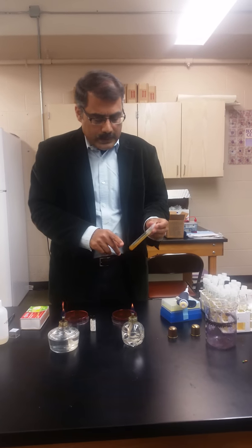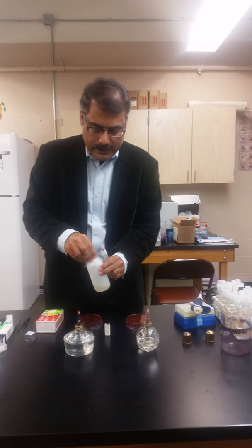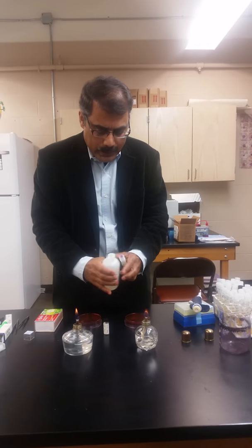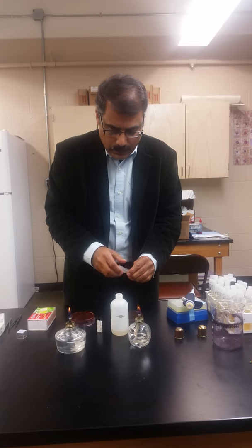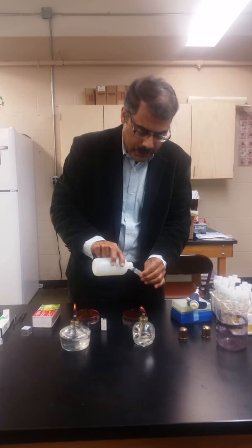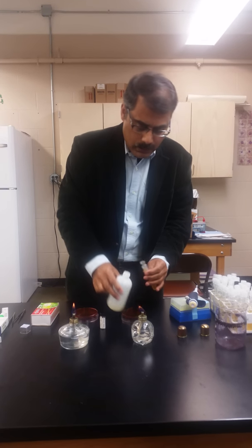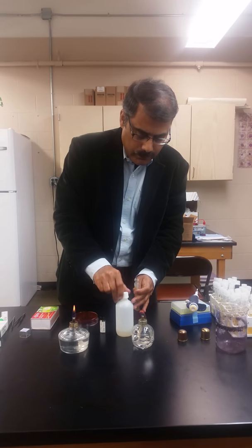So what we need to do is, because it's on solid agar, basically add some liquid in here, which is the medium. Just a little bit of that so that I can make a suspension of bacteria in here. So that is more than enough.